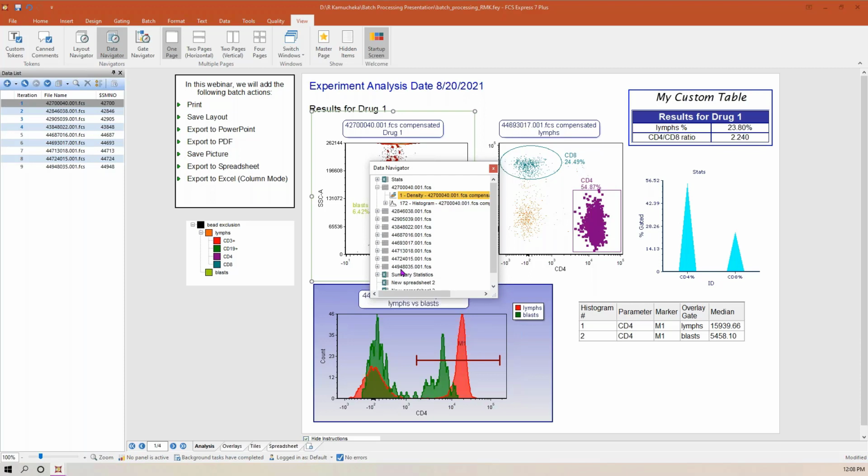So having it is okay in this layout. But if I didn't do that, that would be another way that I could deactivate my iterations. But I can see here that I have an additional plot for this data file, but I see on my other 2 plots, I have a different sample.